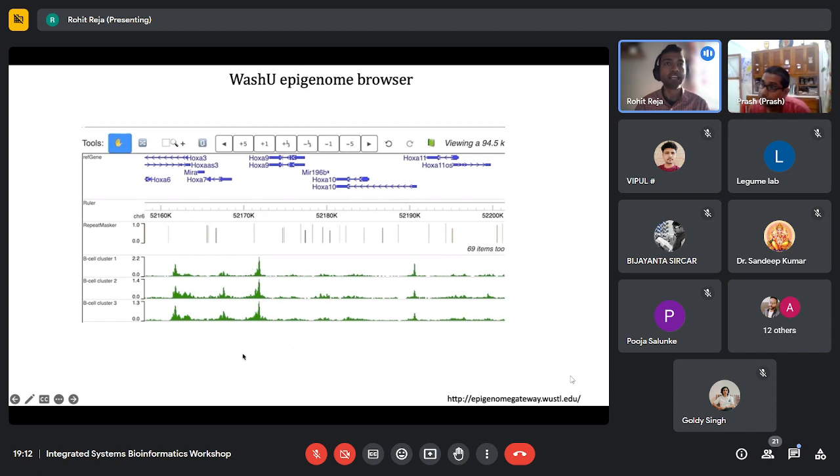You can see within your long non-coding RNA if there's a preference for that protein to bind to a particular region or motif, and you can determine that through the genome browser as well.